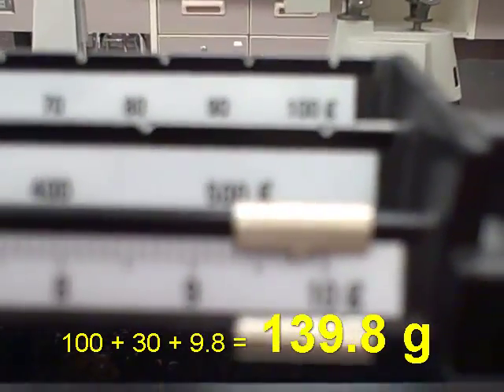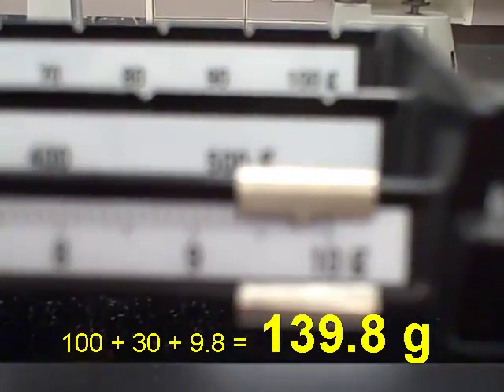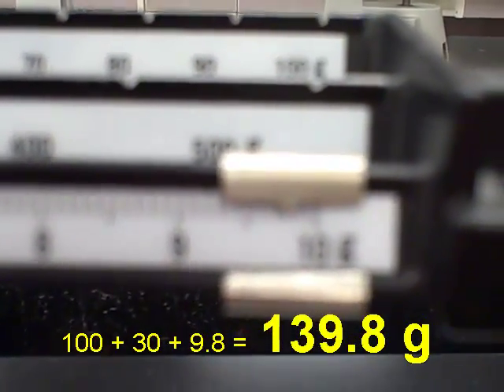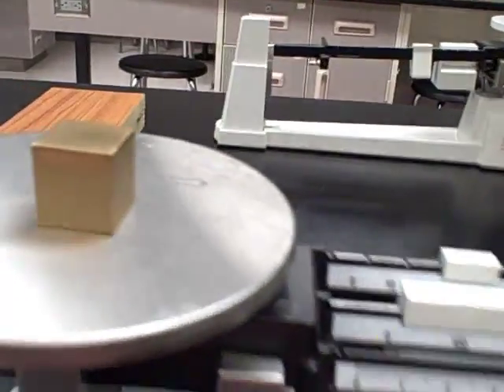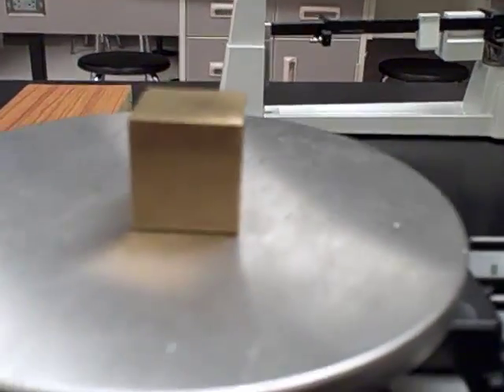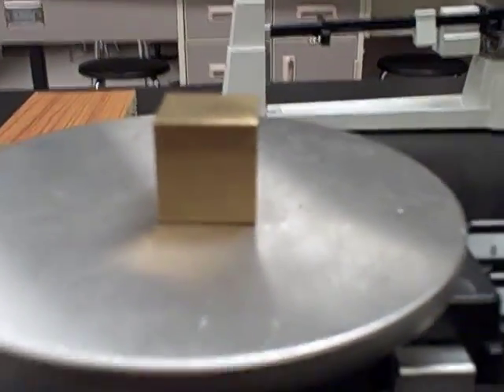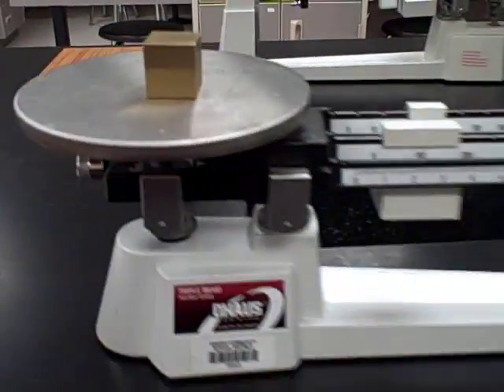So, 139.8. 139.8 grams would be the mass of this cube. That's how you use a triple beam balance to measure mass.